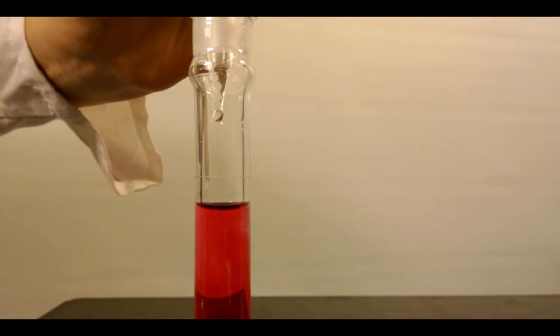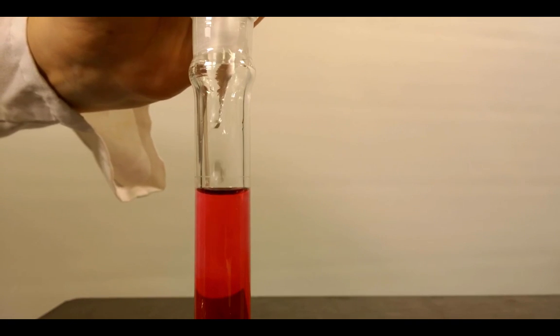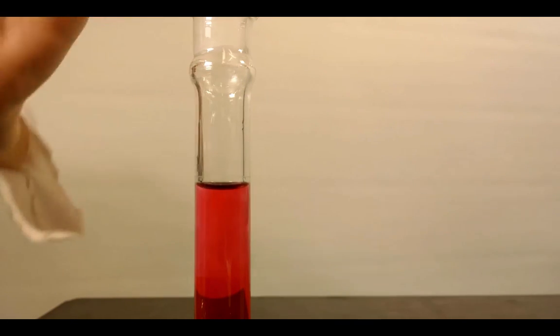Drops should be added into the middle of the neck of the flask rather than down the walls. This allows for better visualization of the meniscus.